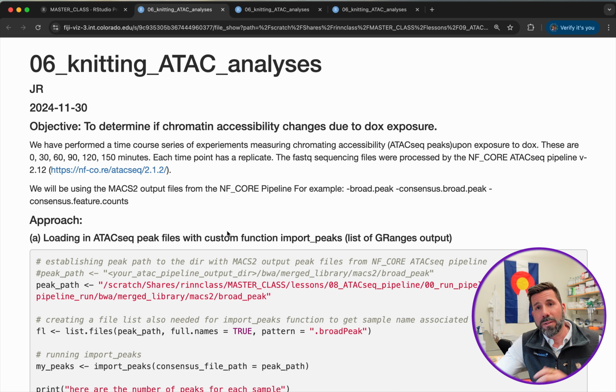All right. Thanks very much. Congratulations. You've done it all. You can do RNA-seq and ATAC-seq and overlap them, and you answered a really interesting question about whether DOX affects stem cell gene expression, and it does. It affects hundreds of genes, but it does not affect the chromatin state as measured by ATAC-seq. So you are now people that know that. Congratulations. And we'll see you on level 10, where maybe you could make a figure and contribute to a citizen science project to make this into a primary publication. Thanks very much.